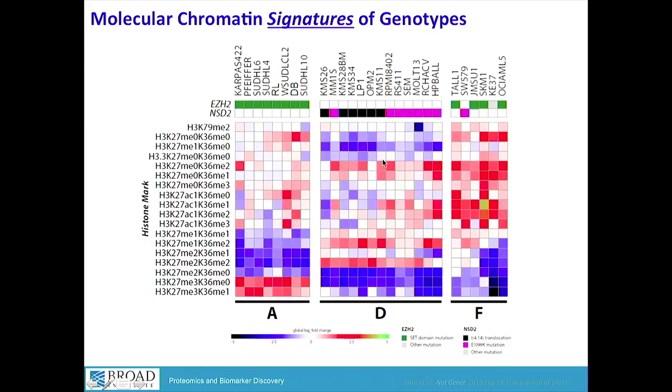So recognizing through the signature, through the specific set of changes that seem to be repeated across these two very different genotypes, we were able to figure out the biology of this and went on to show that, in fact, it is a gain-of-function mutation and is potentially a driver mutation for cancer, specifically ALL. And so the idea of a signature is just this repeated, recognized pattern across groups of samples in a targeted proteomics panel assay.